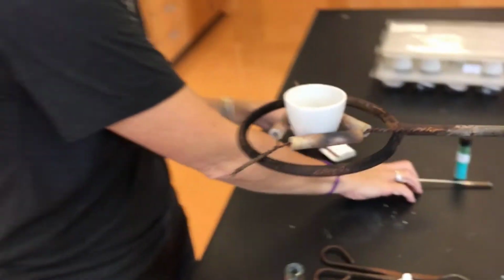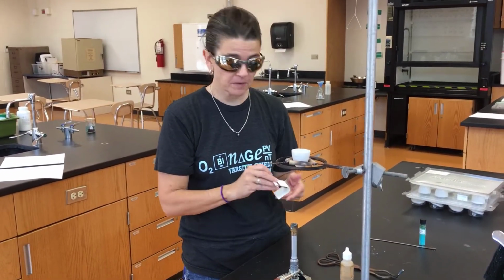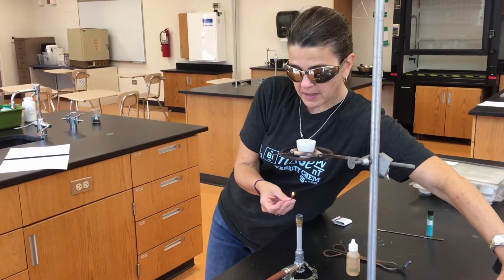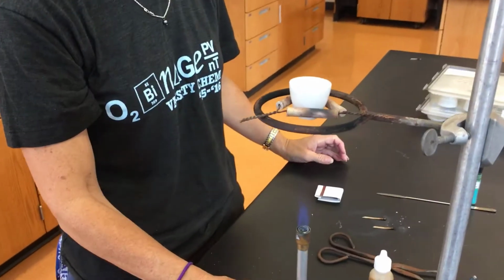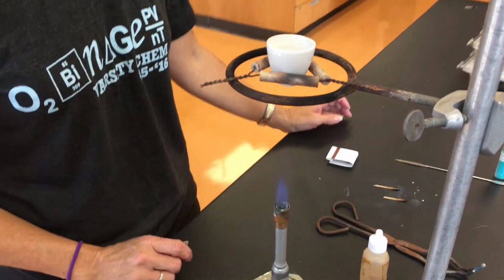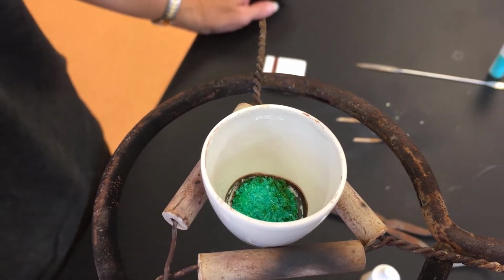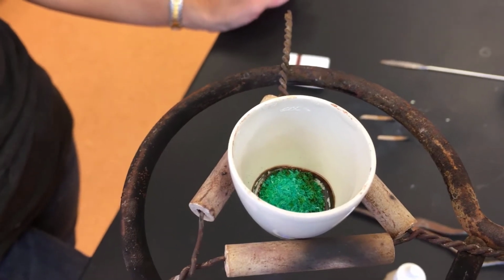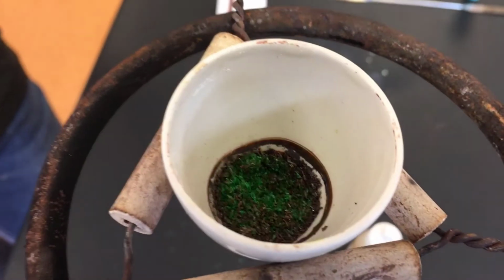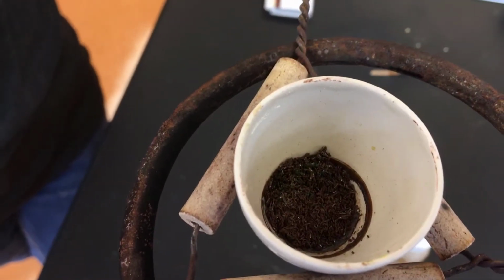And now to drive the water off, we need to heat it, but we need to heat it gently enough that we don't drive off anything that isn't water. It is possible to separate this compound and drive off chlorine if we are too aggressive. As we drive the water off, you should be able to note a change in the color of the substance that tells you it's working correctly. Okay, you can see the change in color occurring.